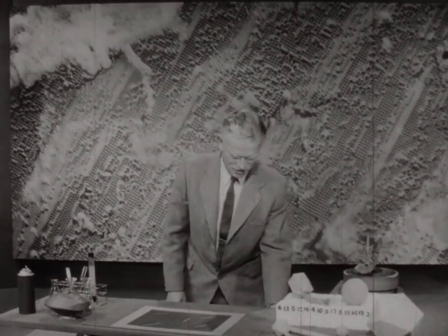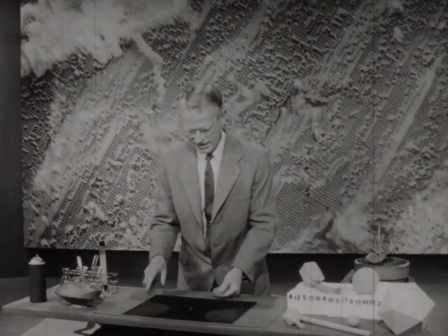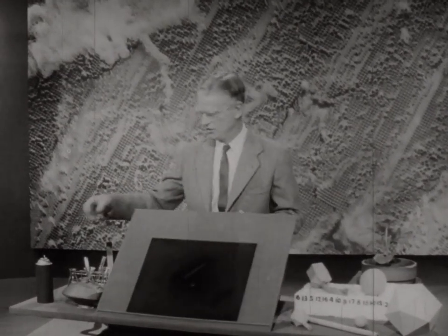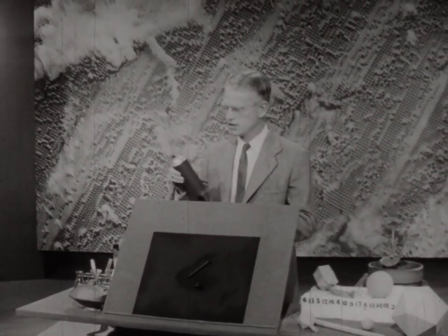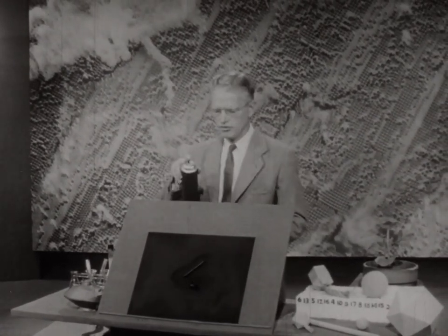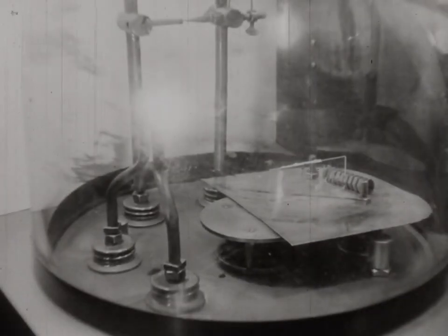It's possible to do a job of shadowing, actually, by using a paint can, and if we do this, we find that what happens, suppose, for example, we have a tobacco mosaic virus and a polio virus, and now we can just plain shadow these things. And on the far side, or the shadowed side of each particle, we find that the paint isn't there, and so we have made a shadow.